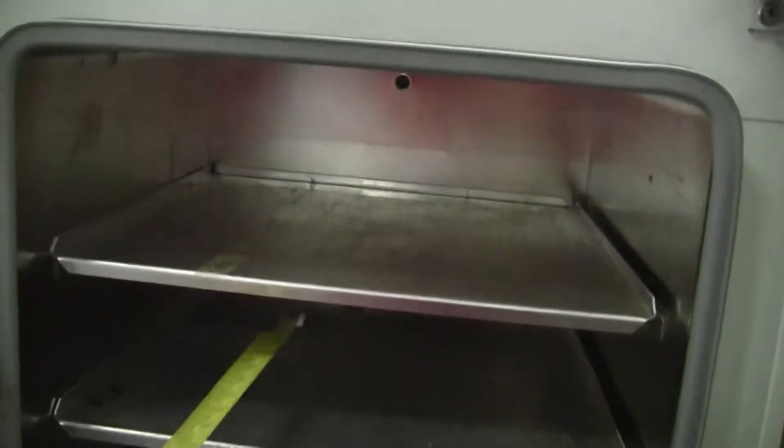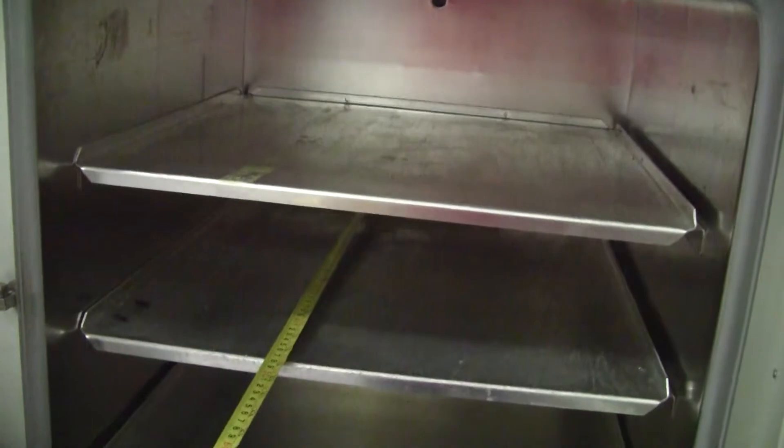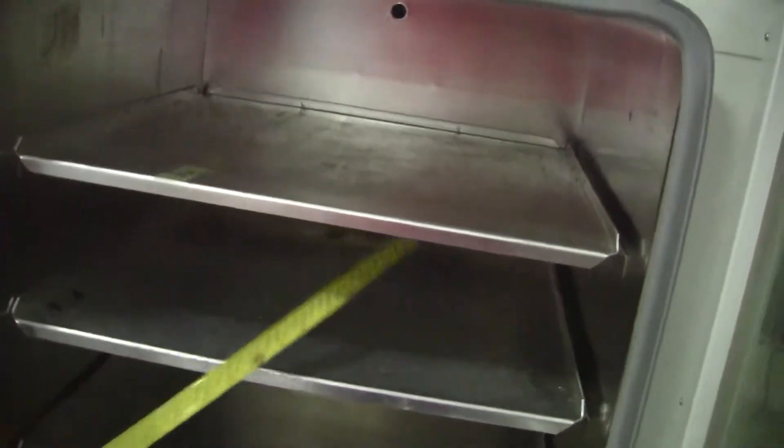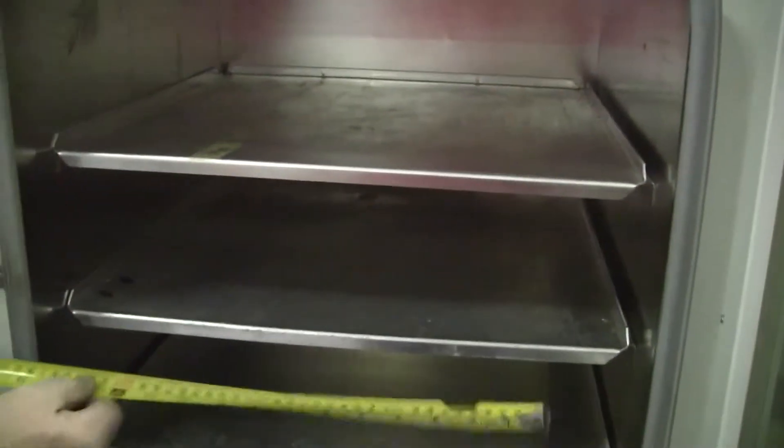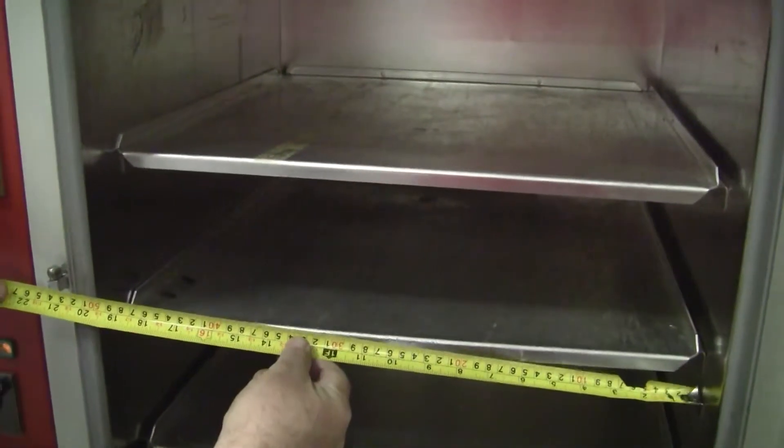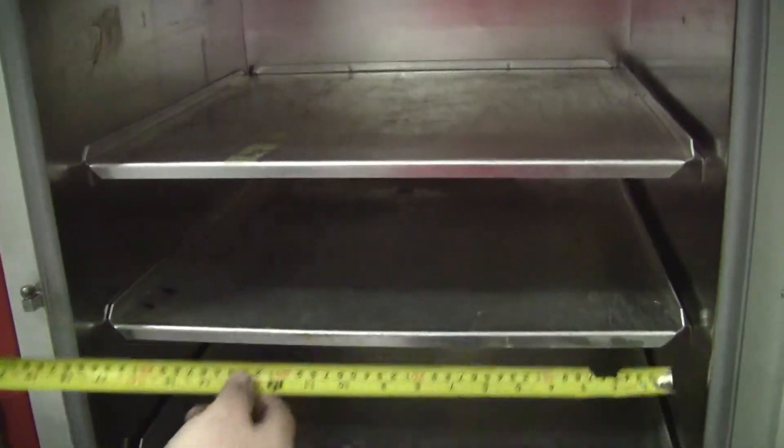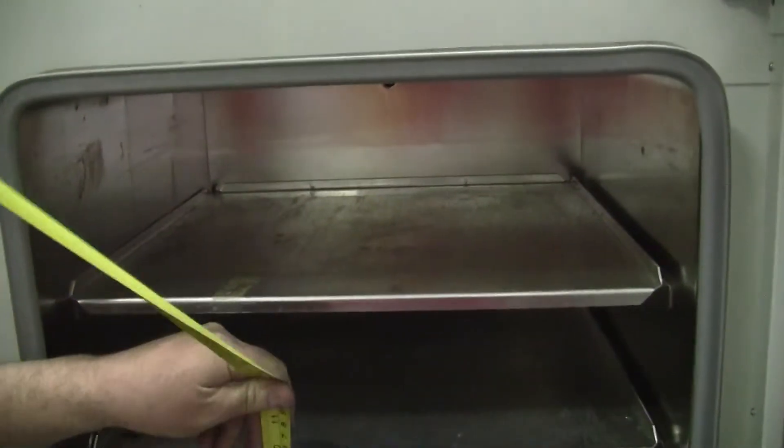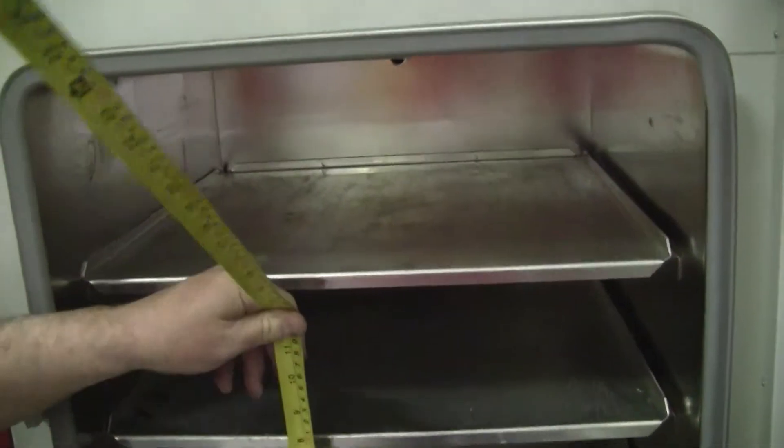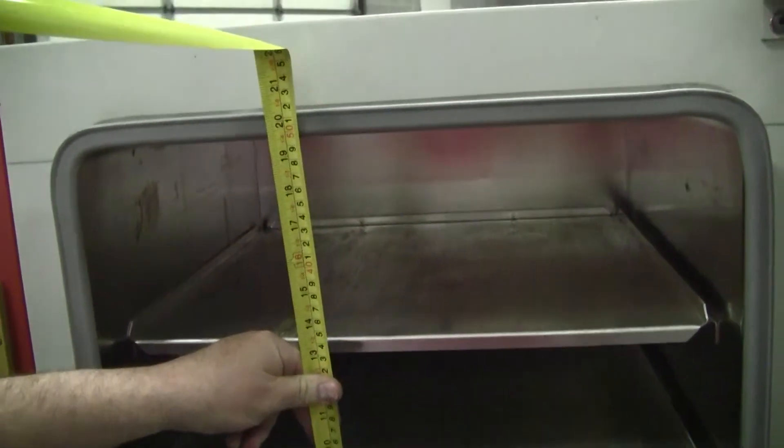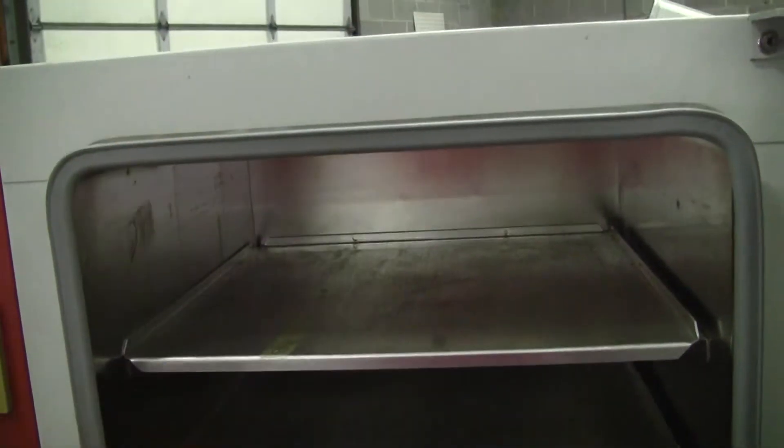We're going to measure the shelf size. Eighteen and a half by nineteen. Eighteen by nineteen. And overall height, nineteen and a half.